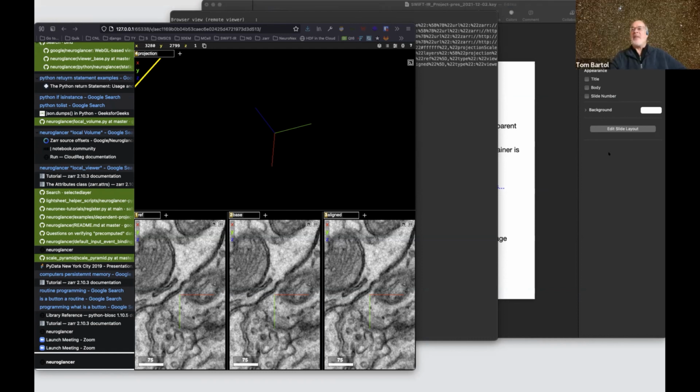And then this question of metadata that Joel mentioned. I'll point out that some of the team members, I think Lindsay and Masa, have pointed out that right now in alignEM-SWiFT, your JSON project file is separate from your images.